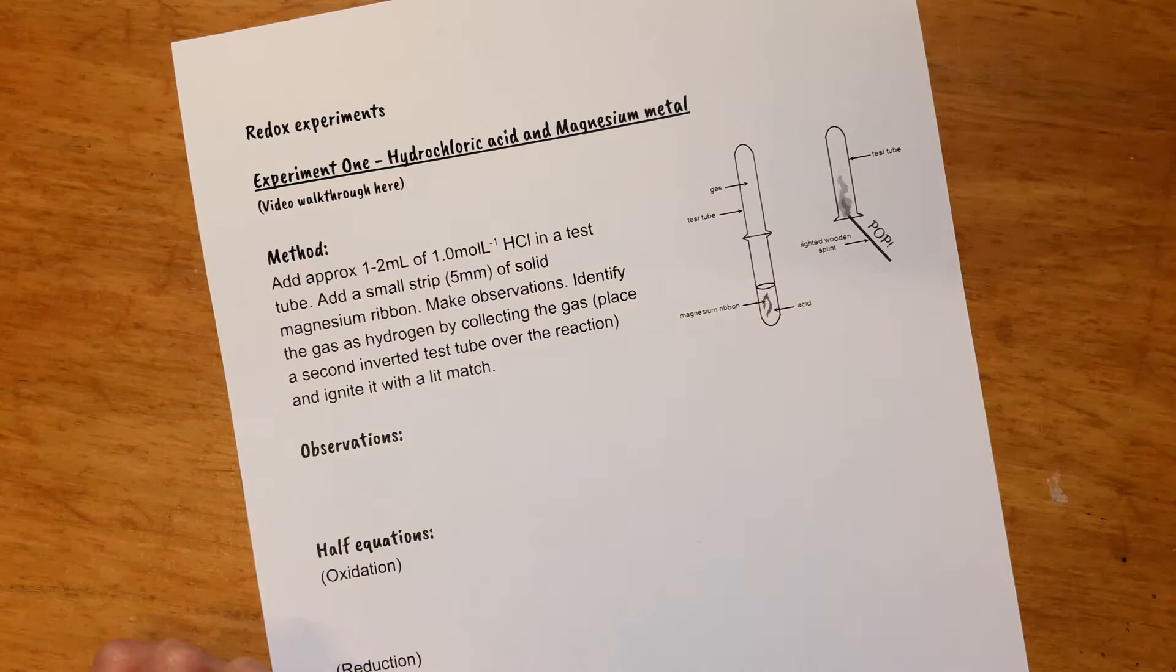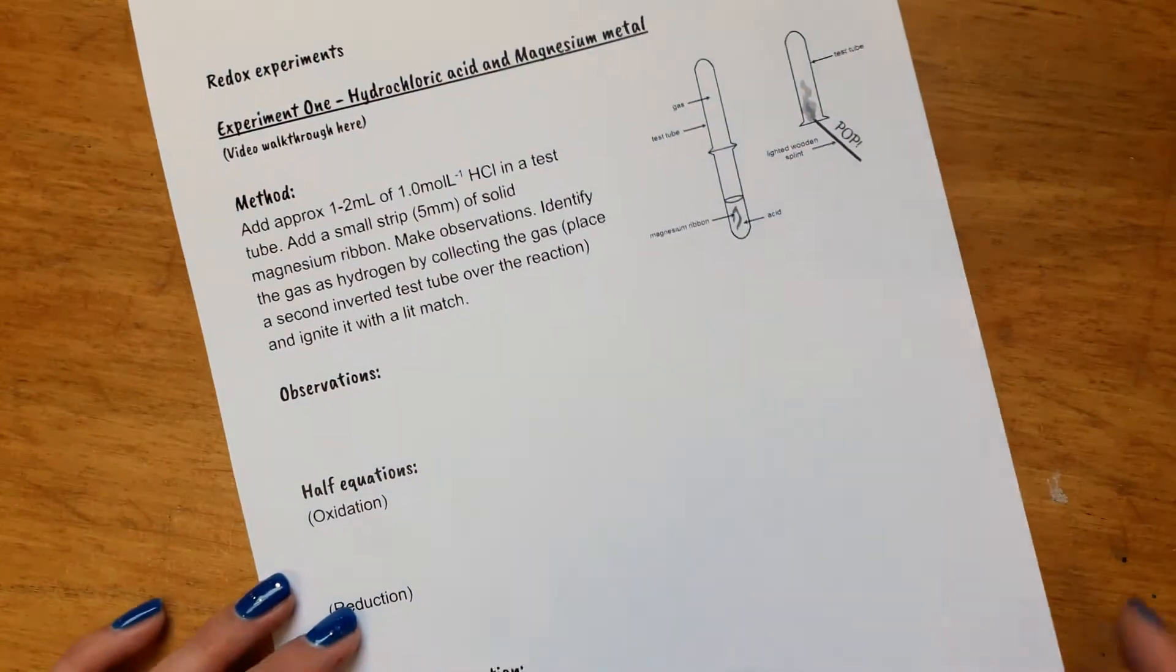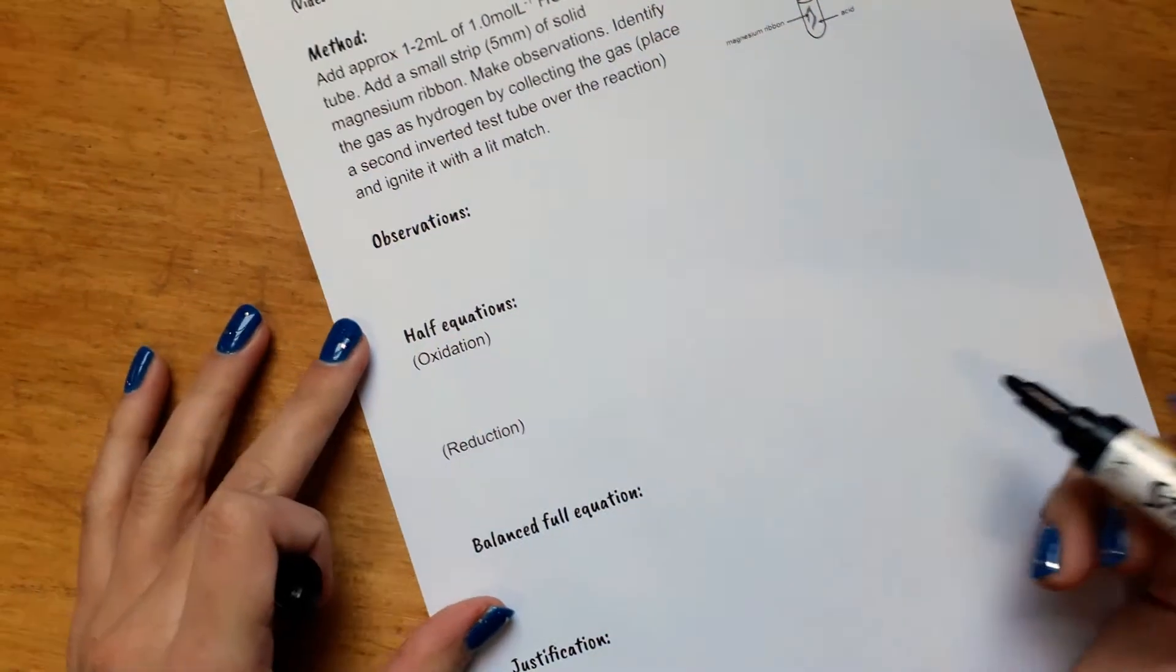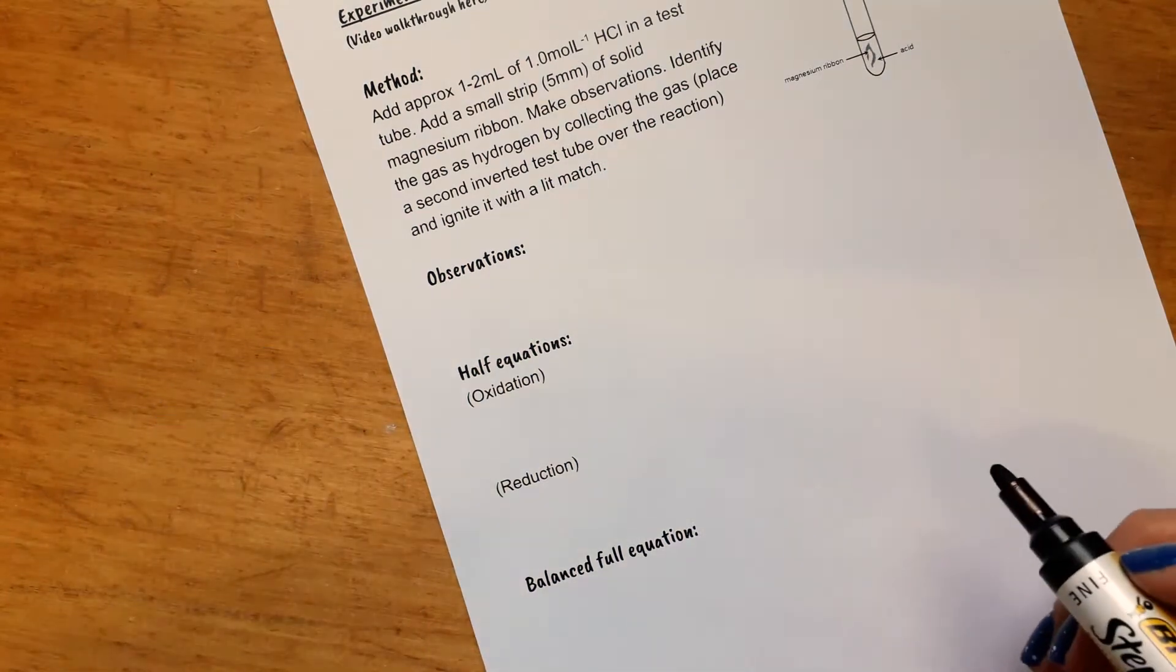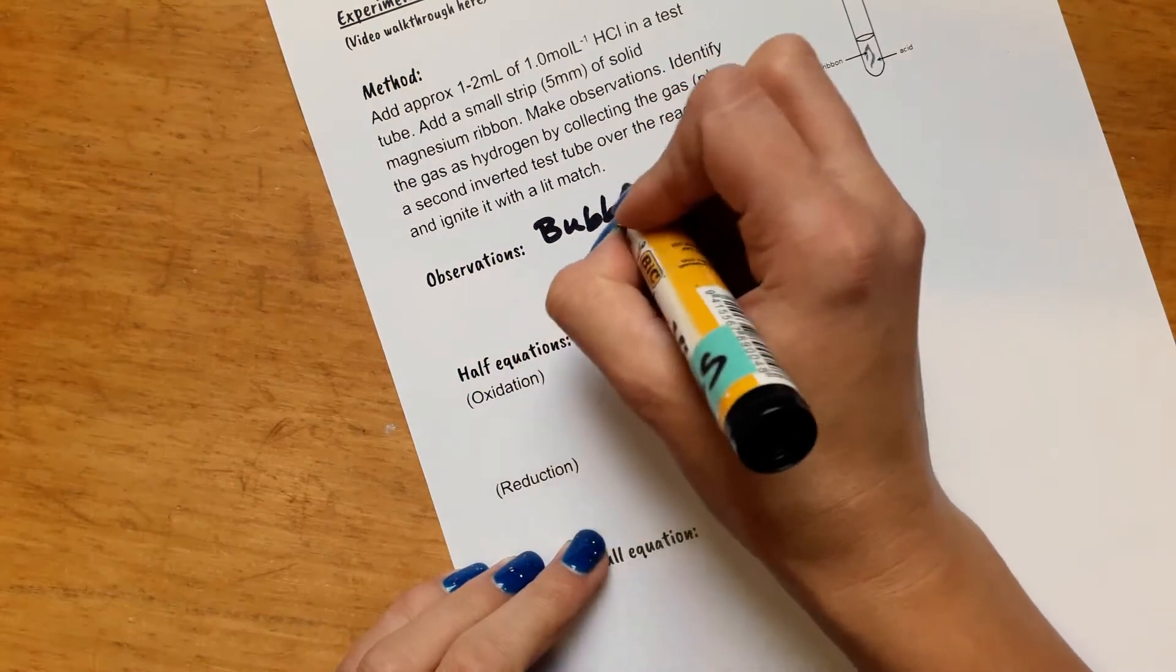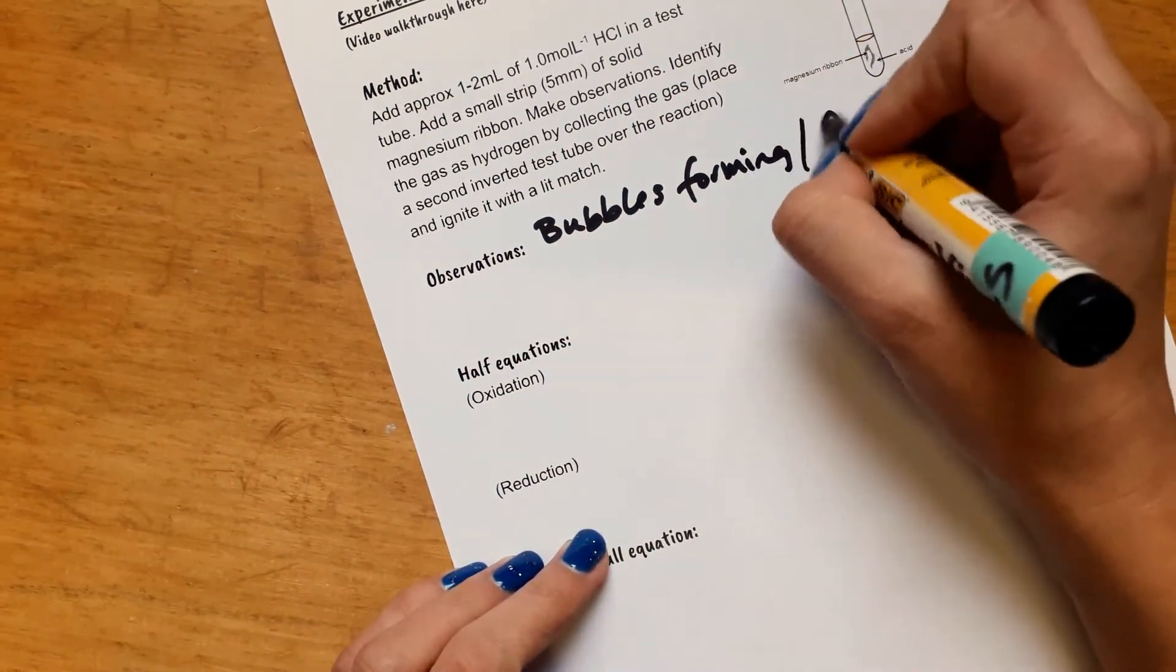Okay, so coming back after having done that in the lab, let's look at how we can write up what we saw. So observations would be something like, you don't say that hydrogen gas is produced because you can't see that, but you can see bubbles forming or fizzing. You can also maybe feel some heat coming off that.